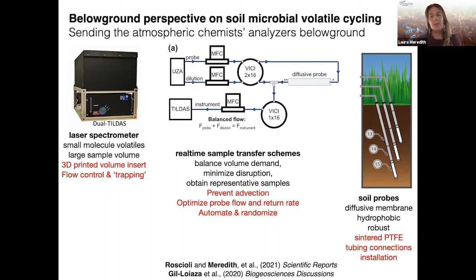For the soil probes, there are a lot of different materials that we can choose from. We've been using sintered PTFE, which is a fairly robust material that can go into the soil system. It's hydrophobic, and we're working on different methods for installing these.